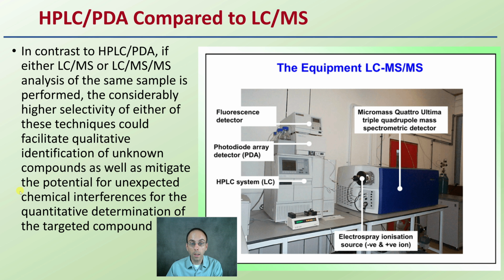Basically, it's more precise at looking at very specific compounds, which can be very beneficial when we're dealing with a plant material that can have a whole host of potential other chemicals or background noise there. We want to be very selective in the sense to ensure we're getting a quality result, a targeted result, and a very selective result. So while this might seem a little complicated, studying all of the analytical equipment, it's just part of you being an informed consumer for typical products that you may look at purchasing, or as a grower are looking at getting submitted to a lab for analysis.